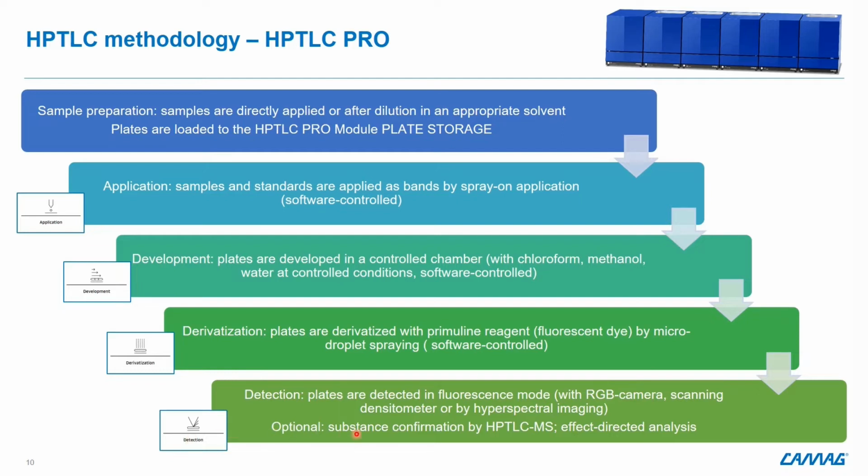In addition to the classical UV-Vis detection, selected zones can be transferred to a MS with the help of the elution-based interface for HPTLC-MS.